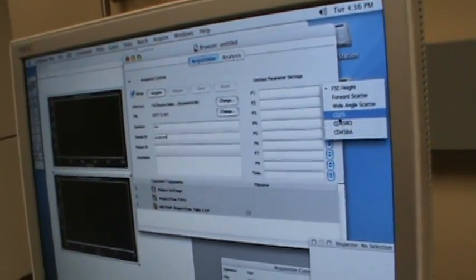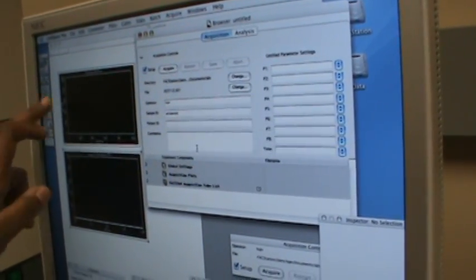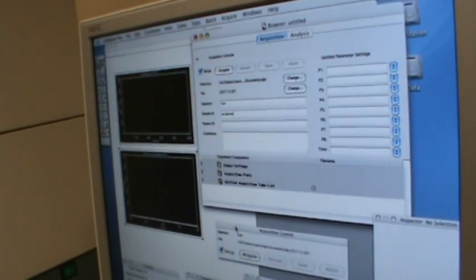If you're looking at different types of CDs, you can have them titled, with this side is this, this is that. So this is how you acquire. Wait a minute. If I don't title it, the data will basically save as P1, P2, P3?